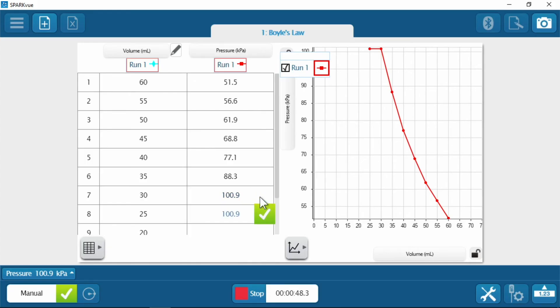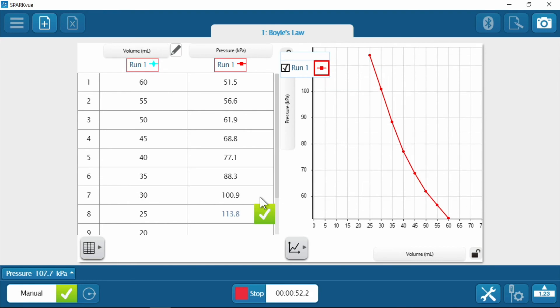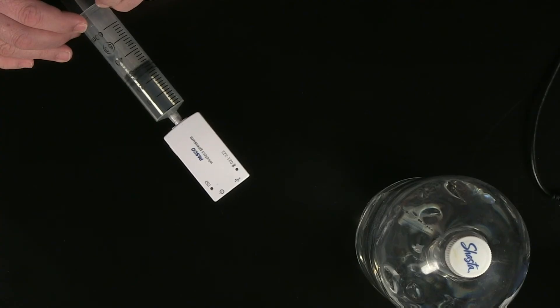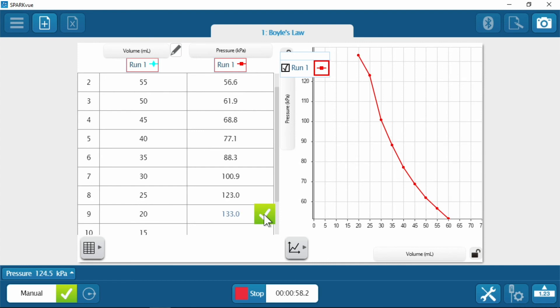I couldn't even let go and it's right back to where we were before — so there must be no extra. Here's your next challenge: move it down to 25. All right, at 25. And finally down to 20.